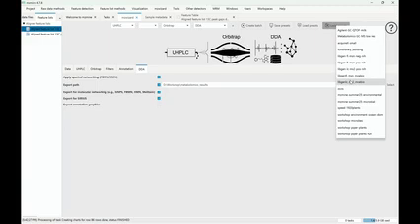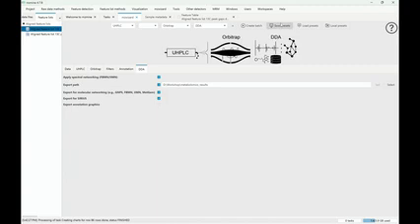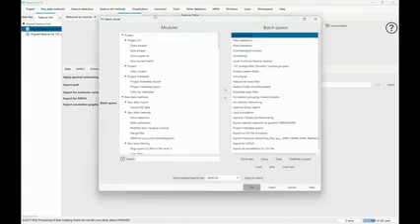Next time, 10-minute gradient with a timsTOF. And then maybe you switch out the chromatography. Maybe you do GC with an Orbitrap, right? So you can switch out the different methods as you go. So we save the preset, and even more importantly, you have to save the batch mode. I would personally save it in a folder. If you publish your paper, put your batch file.